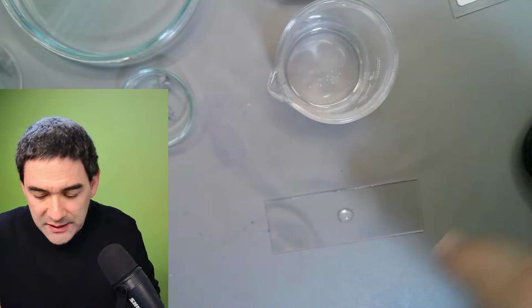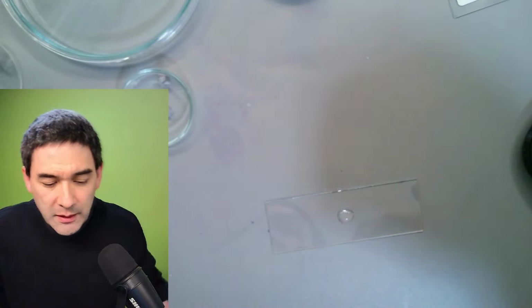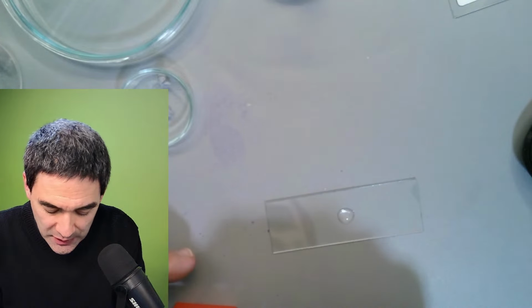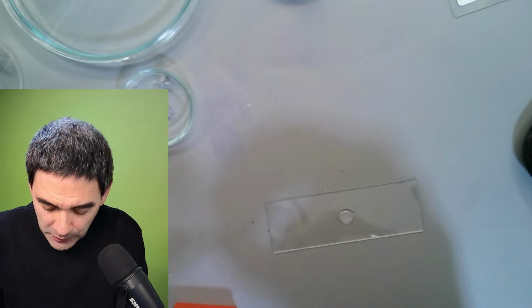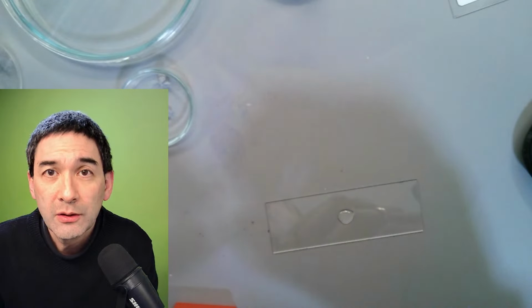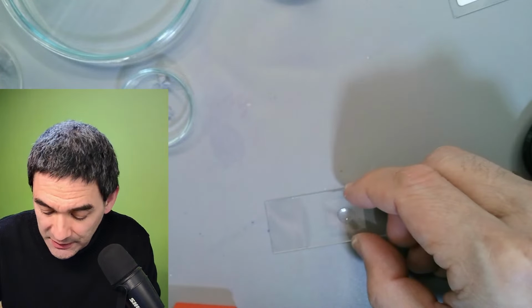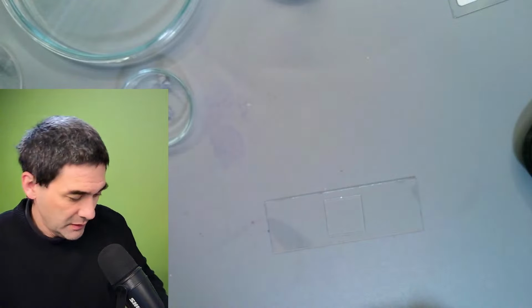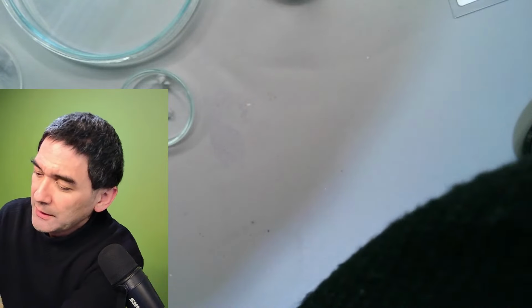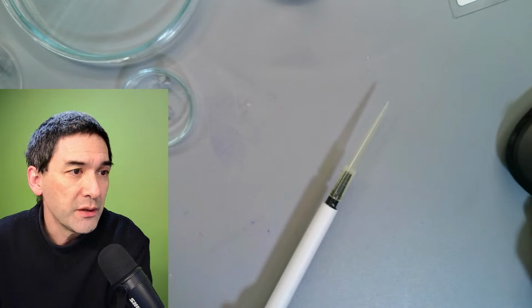This is also something that some researchers have been investigating. These are the fibers that come off from clothing, over the washing machine. The problem is that those synthetic fibers from clothing are not broken down when the water is processed, and therefore they end up in the environment. And that's, of course, a problem. So now, let's see if we're able to find a few things here. This is just some water from a washing machine.